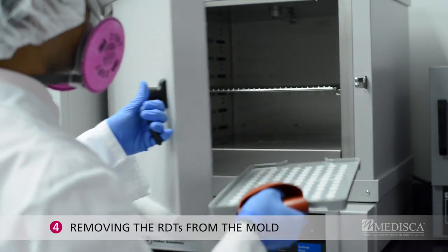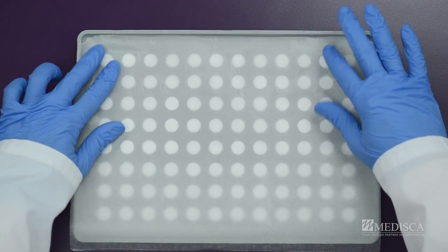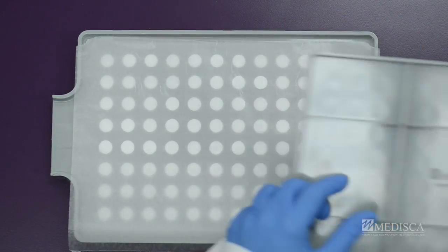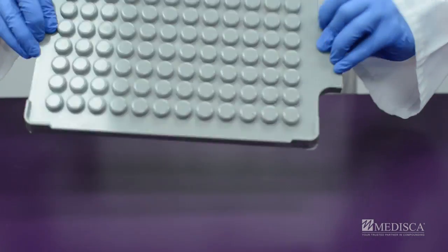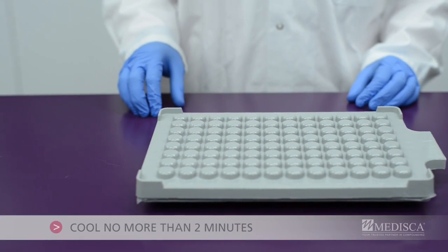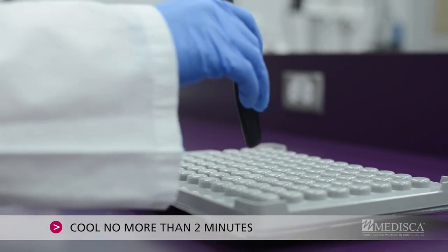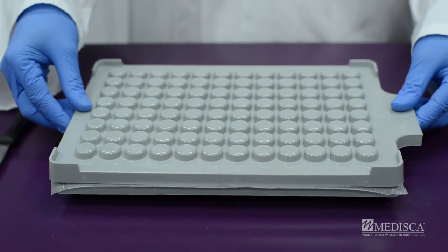Step 4: Removing the RDTs from the mold. Immediately place a sheet of wax paper over the mold, then gently apply the top compression plate without pressing. Holding both plates together, turn the mold over and set it back down. Allow the mold to cool for one to two minutes before gently tapping the bottom cavity plate to release the tablets.